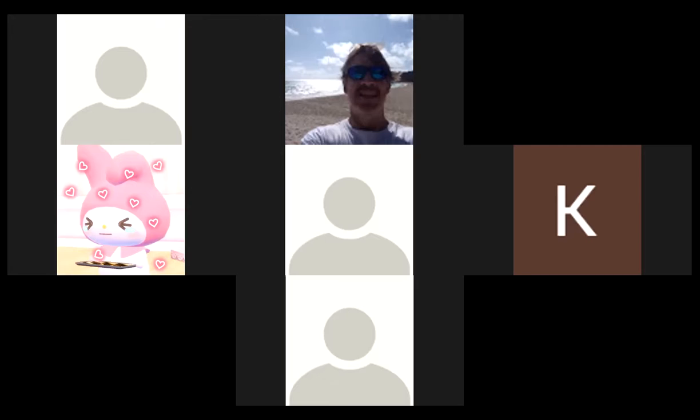One of the main things you're going to do is to draw a graph. Now, when I went through school, we had to make a lot of graphs on graph paper by hand. And so in this lab, that's what you have to do. So I know you guys grew up with computers and all, but you're going to make a graph. The graph paper is provided. And that's going to be the main grading portion of this lab. And so that's where it's a little bit different.